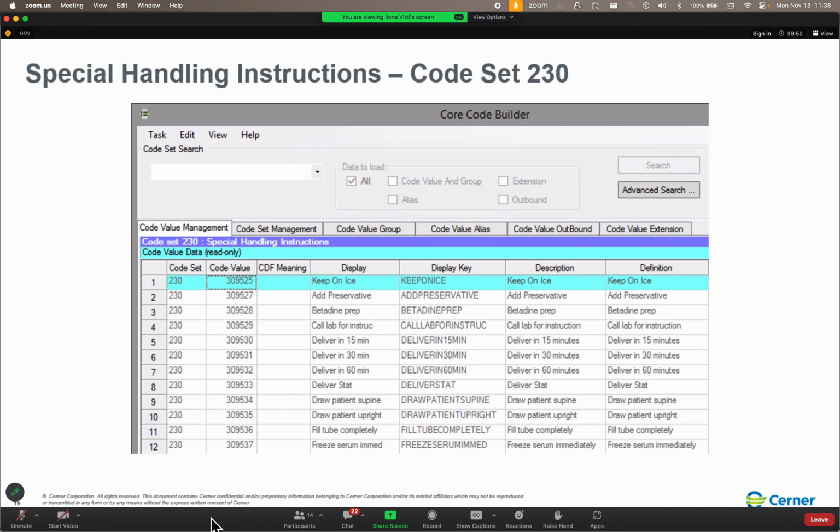So unless there is a reason to change away from the chemistry collection class, we can just leave it in there. And then it's going to function like a chemistry. So I'm a big fan of this one, especially for those larger sites. Now, I will say, go ahead and back up here, I will say one thing.